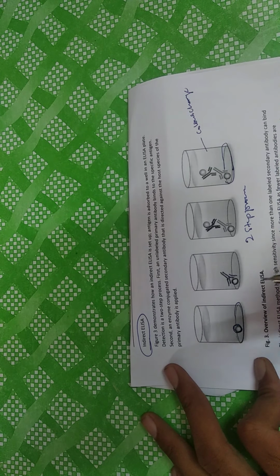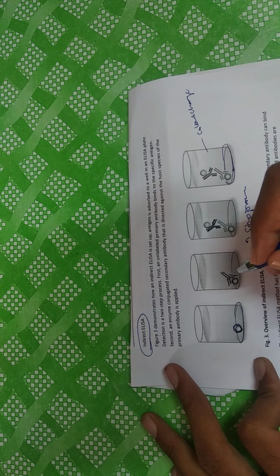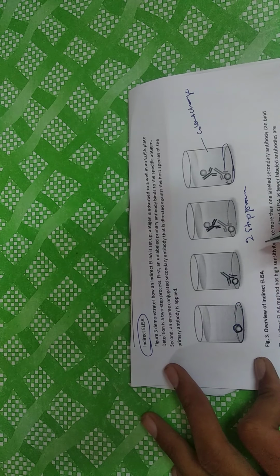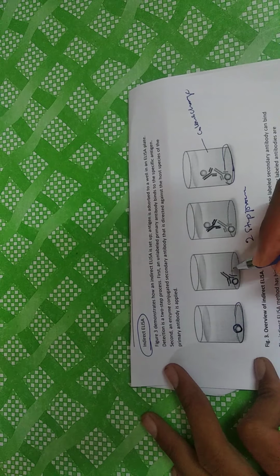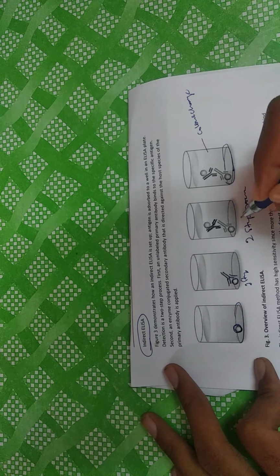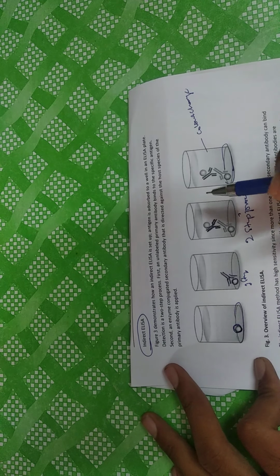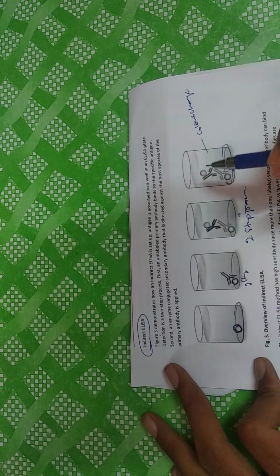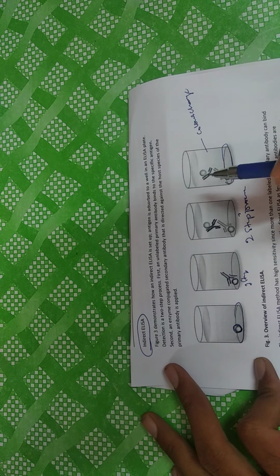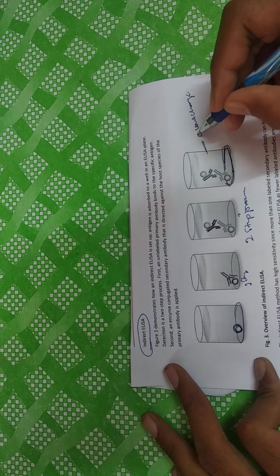In simple terms, it occurs in two steps. First, the unlabeled primary antibody binds to the specific antigen. The second step is the enzyme-conjugated secondary antibody that is directed against the host species of the primary antibodies applied. After adding it, there will be a change in color that we can detect.